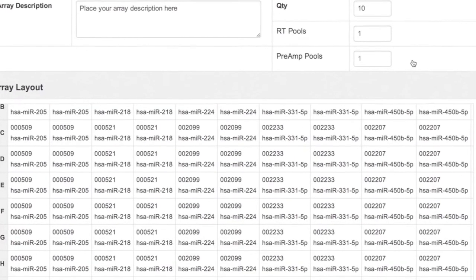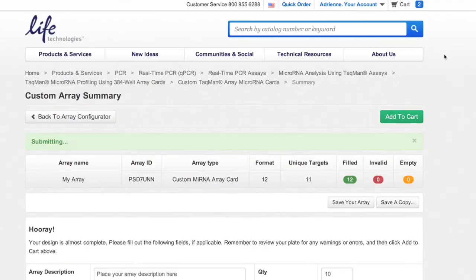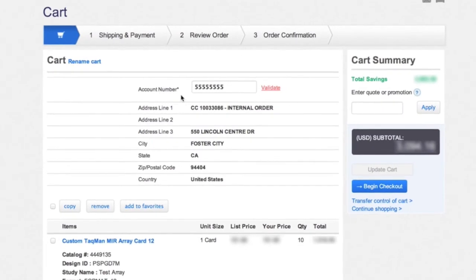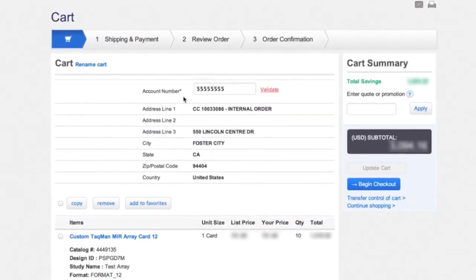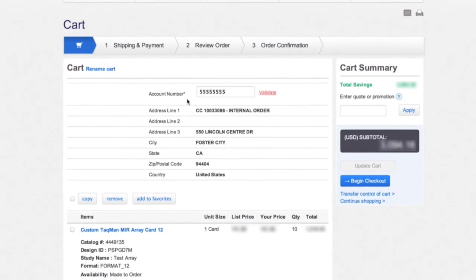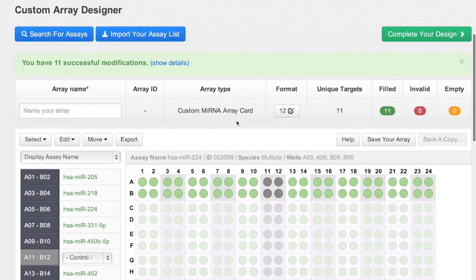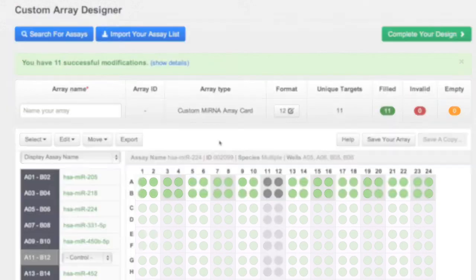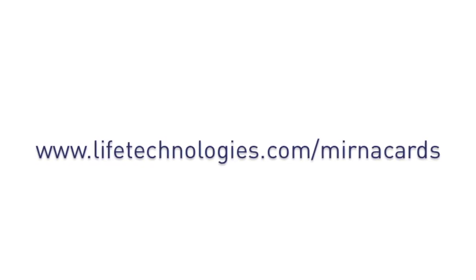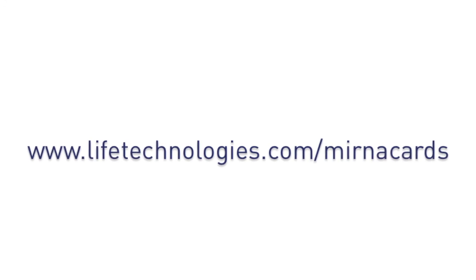Then review your card layout. When you've provided a description and confirmed the quantities, submit your request. Finally, review and complete your shopping cart transaction. And that's it! Start ordering pre-designed and custom TaqMan MicroRNA 384-Well Cards at www.lifetechnologies.com/mirnacards.